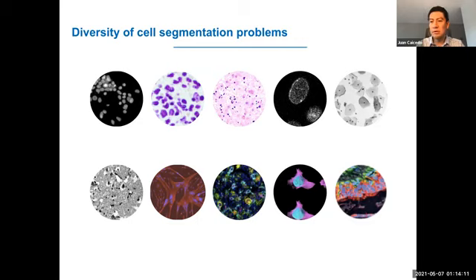not good, because anytime you change your protocol, and biologists like to be very creative about how to combine certain colors or imaging techniques in order to see more and more details about the cells. But every time you change your imaging technique, you're going to have to adjust the segmentation algorithm in order to make it work in practice.